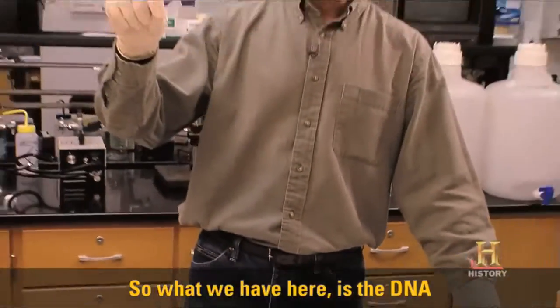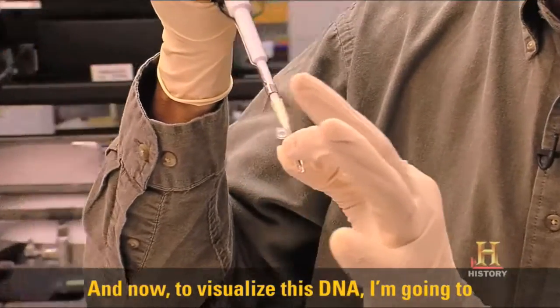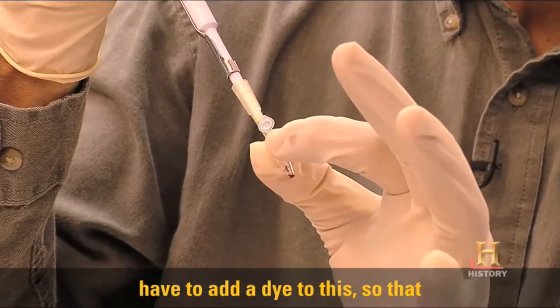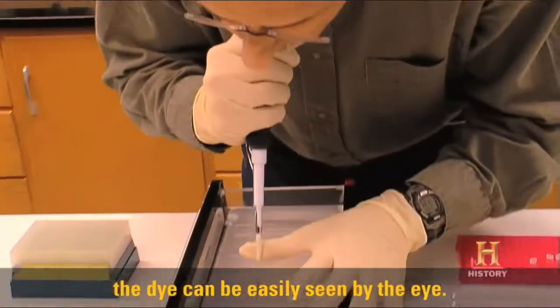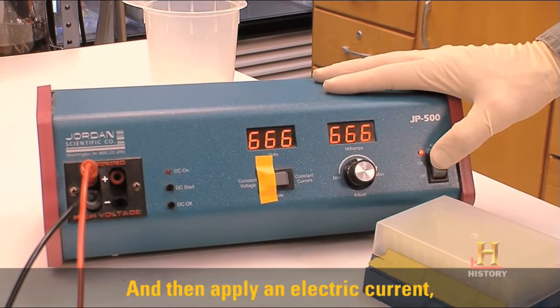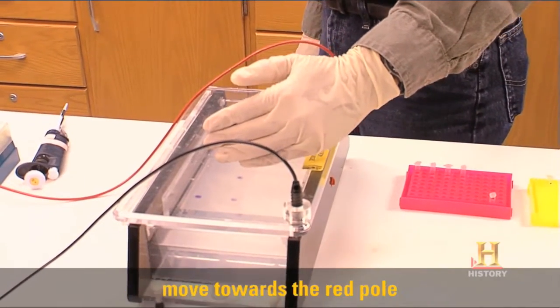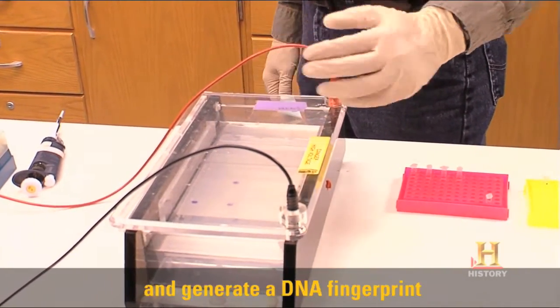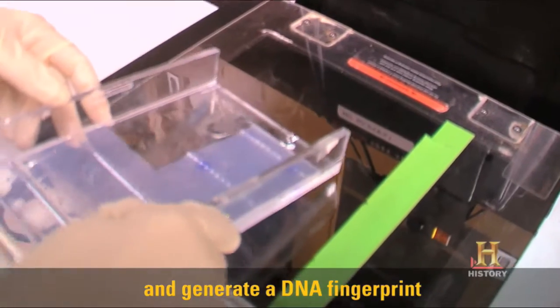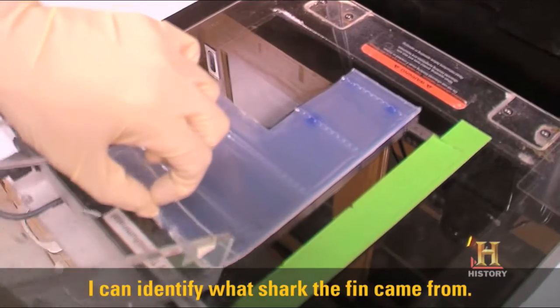What we have here is the DNA that's been copied. Now to visualize this DNA, I'm going to have to add a dye to this so that the dye can be easily seen by the eye, and then apply an electric current. The DNA is now actually going to move towards the red pole and generate a DNA fingerprint that will be easily visualized so that I can identify what shark the fin came from.